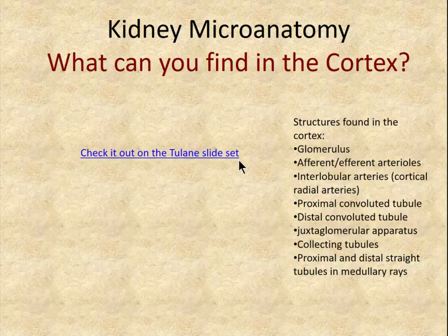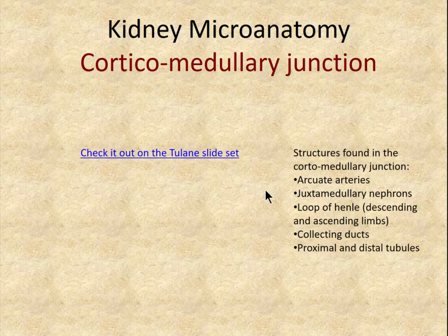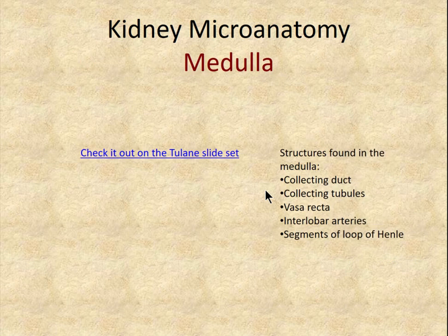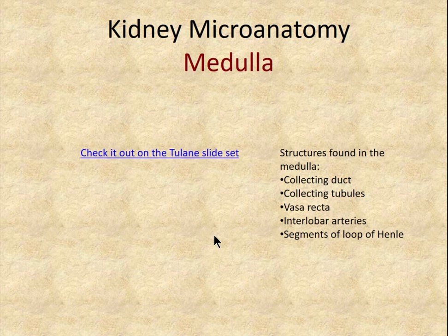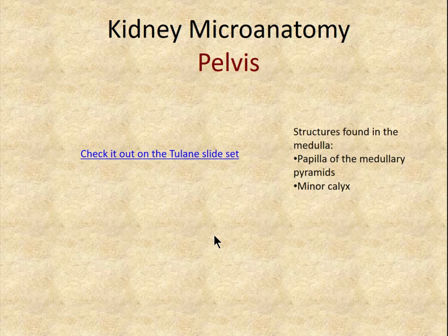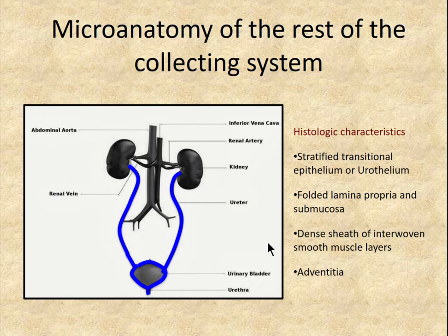A helpful exercise is to identify structures in the cortex, corticomedullary junction, and medulla on histologic slides. Glomeruli are mainly in the cortex or at the corticomedullary junction. About six-sevenths of nephrons are in the cortex, but one-seventh have loops extending into the medulla. At the renal pelvis you can see minor calyces with a medullary pyramid papilla projecting into the minor calyx, which leads into the collecting system.